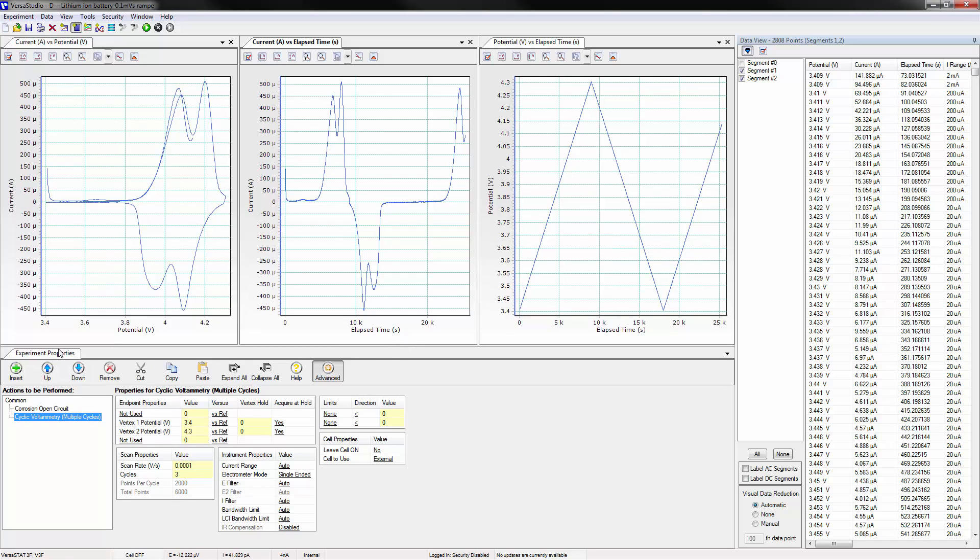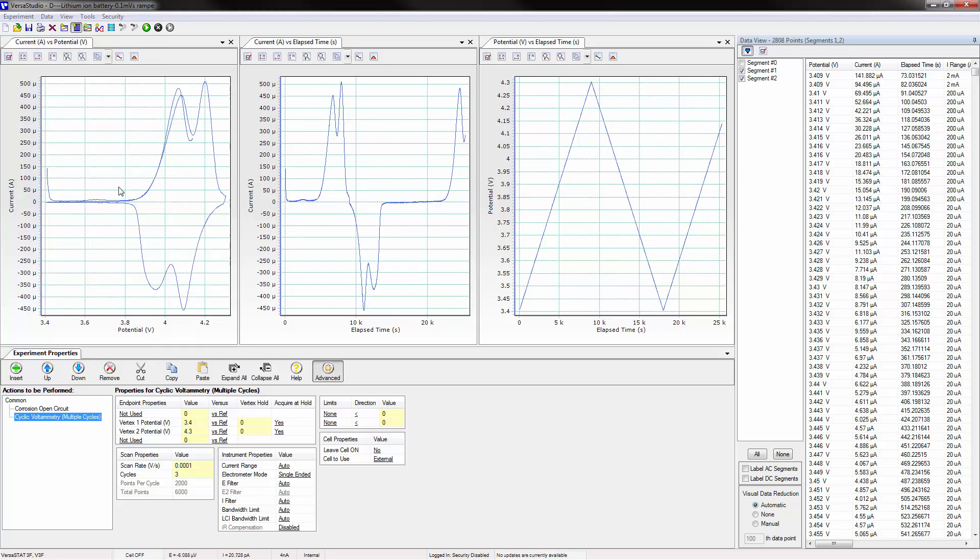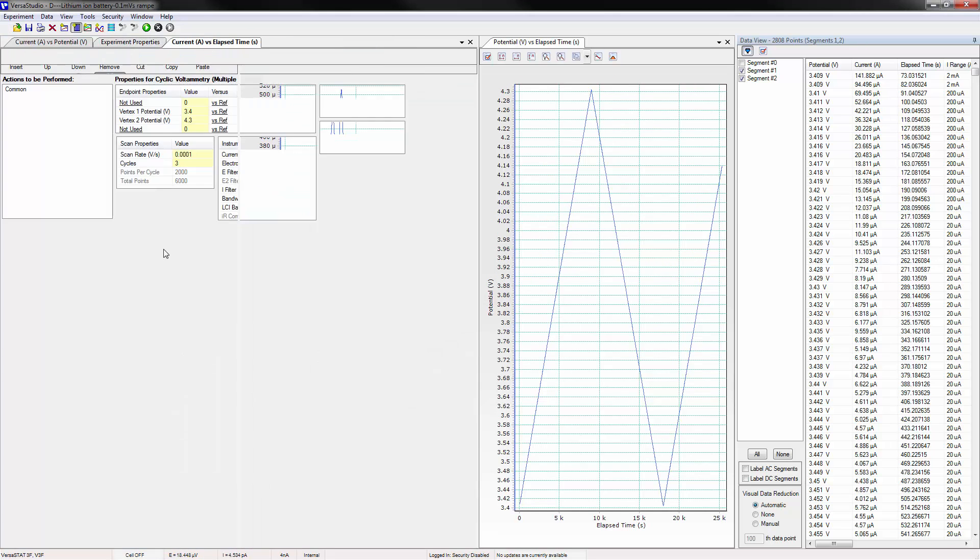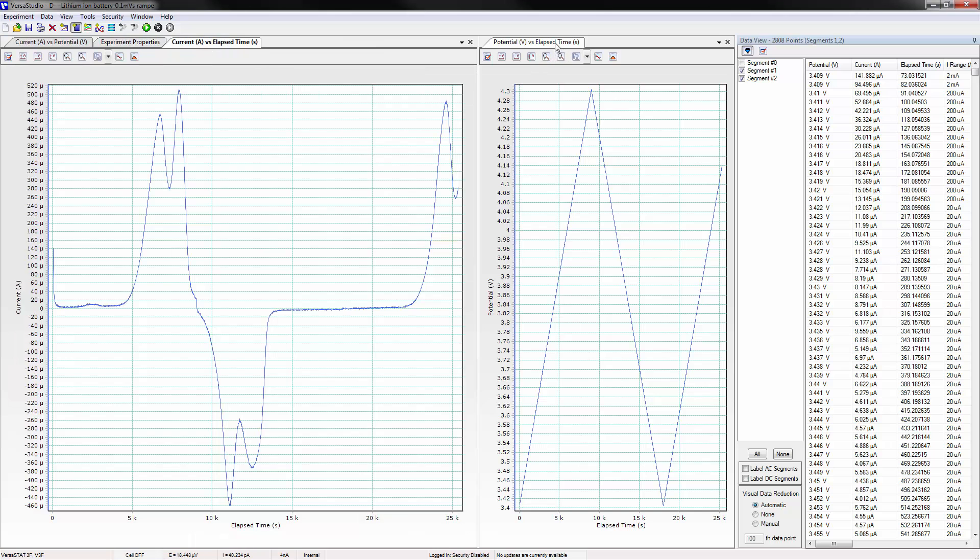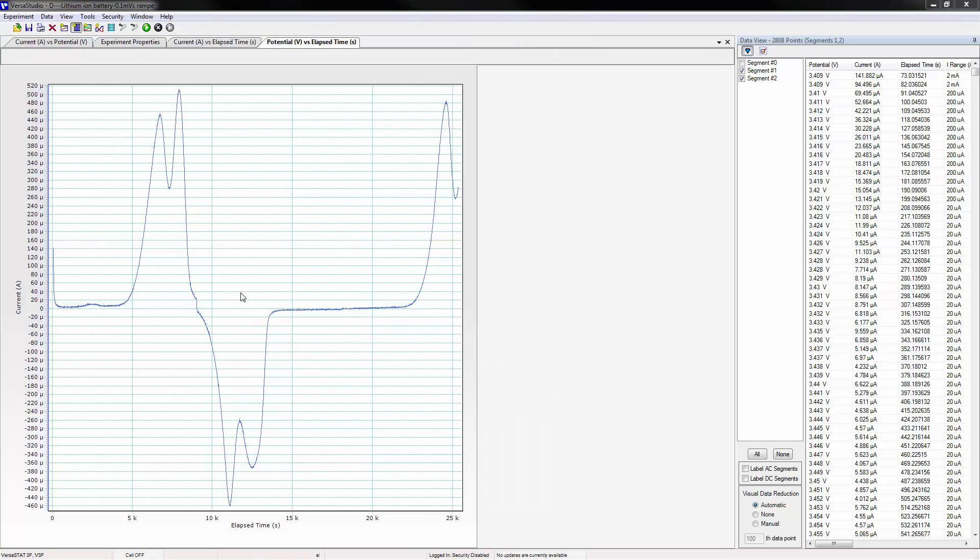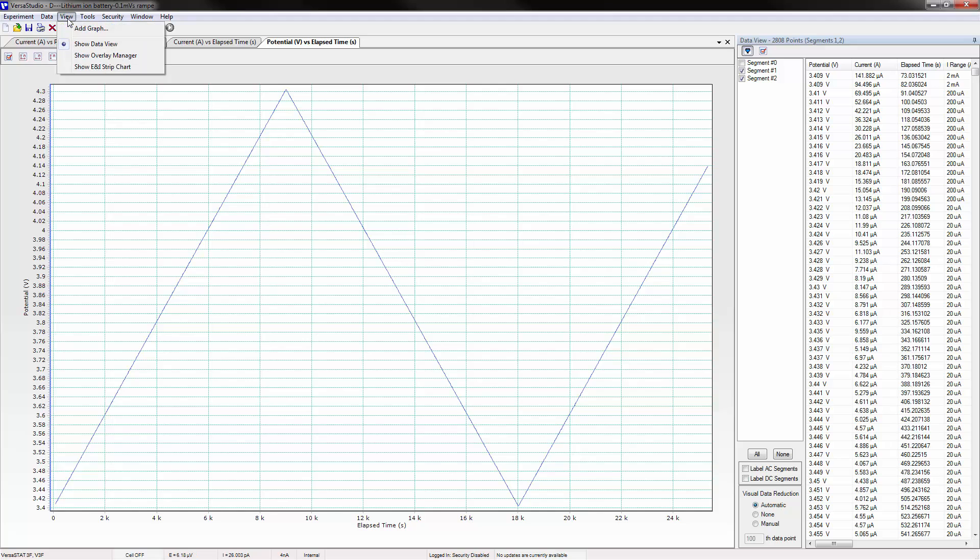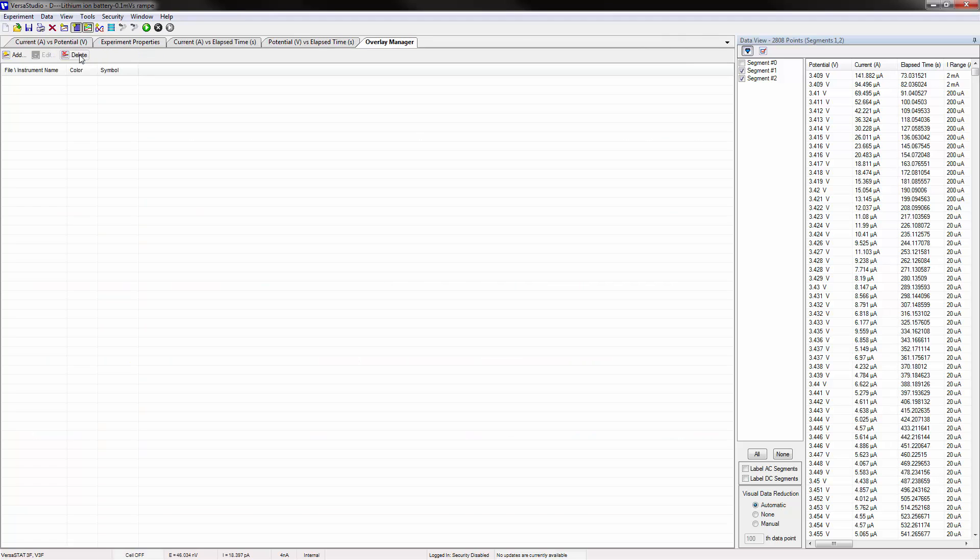The experiment properties window can also be docked and resized. Adding the overlay manager reveals the same options.